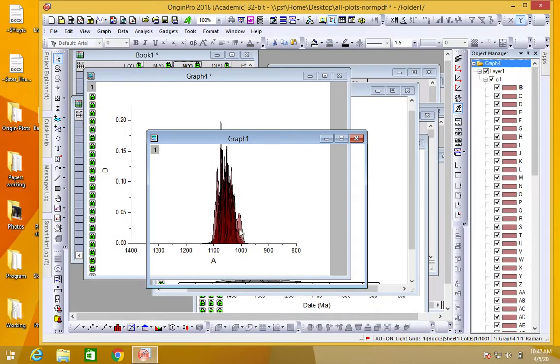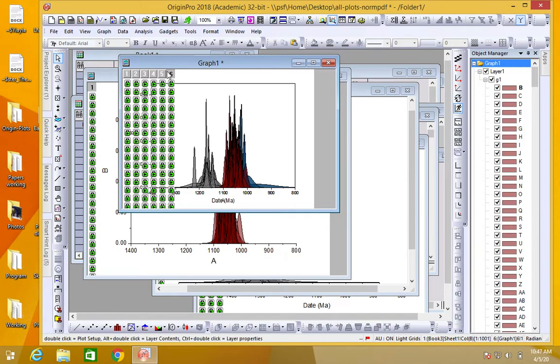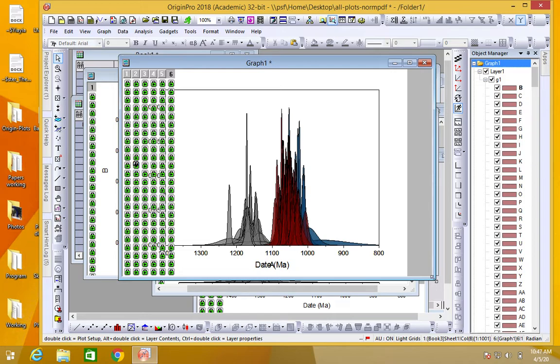And it's going to create another graph here. And you can see it has all of the different graphs that got merged and their corresponding scripts, sorry. So that's a handy way to do it, and then you can clean up and you can delete things from your graph, and you can rename stuff to get it how it will be convenient for you to use.